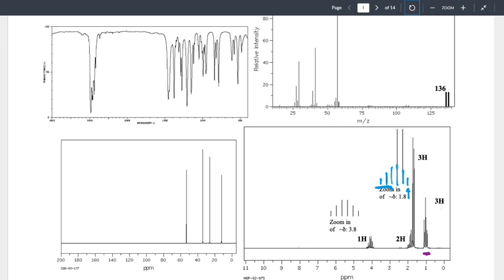multiplicity, or integration, because that means if there's 2 CH2s, they would be the same. They wouldn't necessarily be the same, but if I run that CH2, remember this is that middle CH2, and I say CH2, CH2, what do I expect to see in the rest of my spectra? 2 more CH2s.